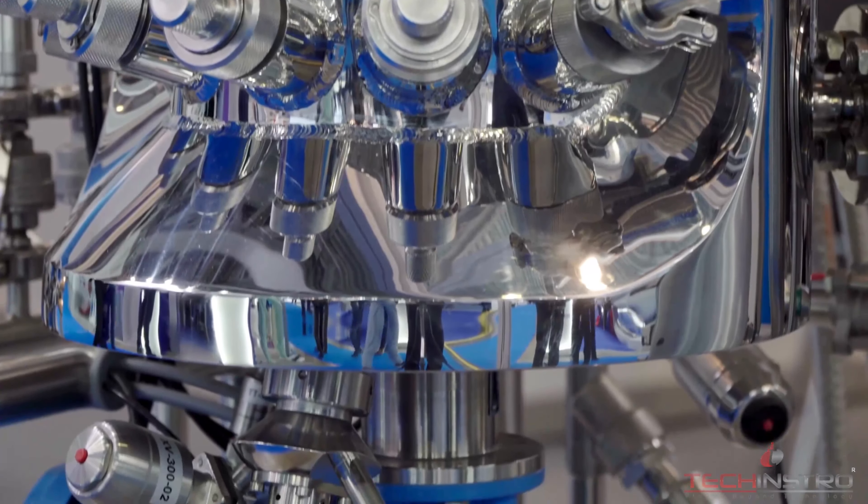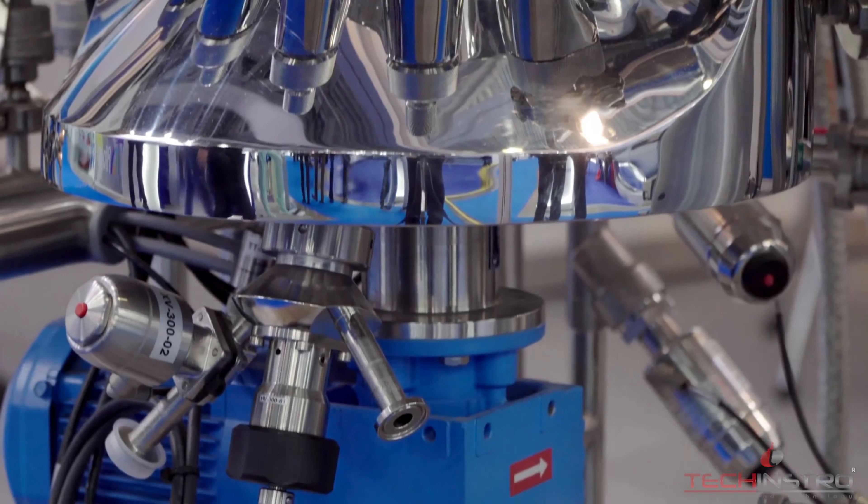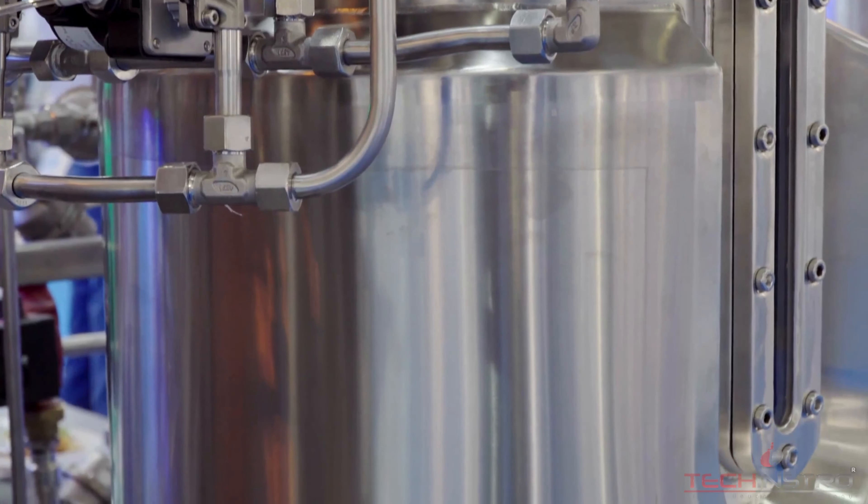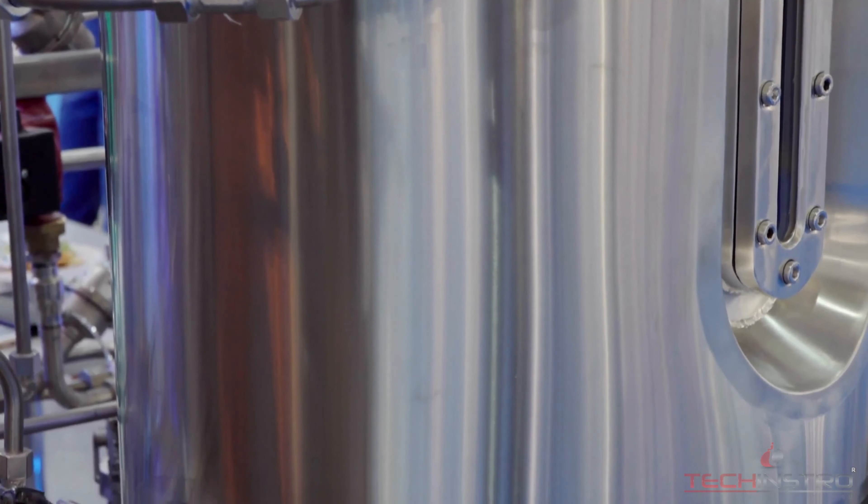Let's understand design and construction. Autoclave reactors are typically made of high quality materials such as stainless steel or other alloys that can withstand high pressure and temperature. The reactor is designed to seal tightly to prevent the escape of gases or liquids during the reaction.